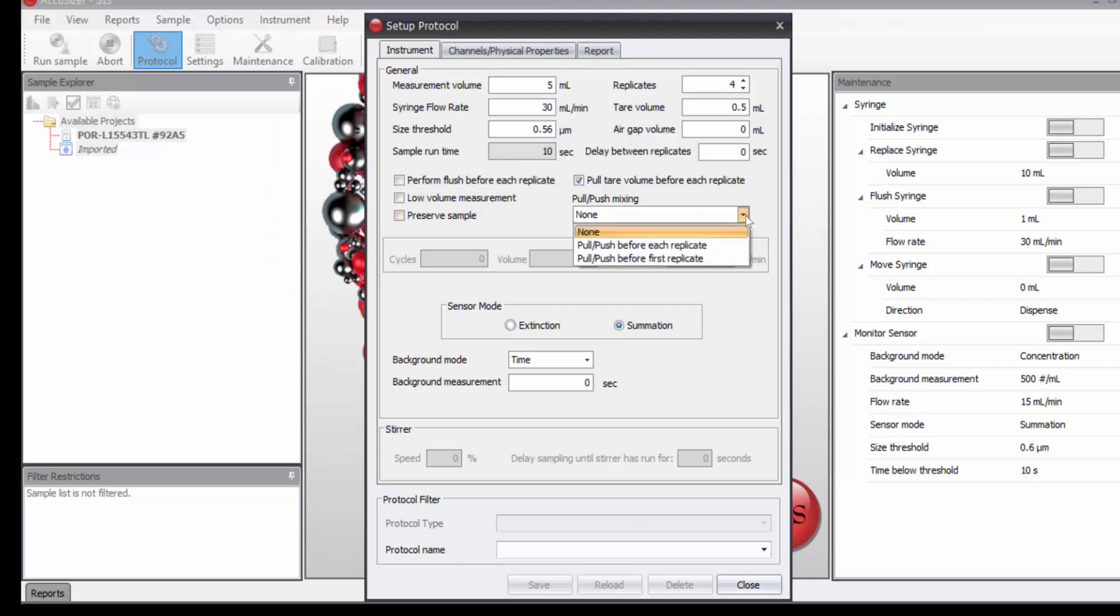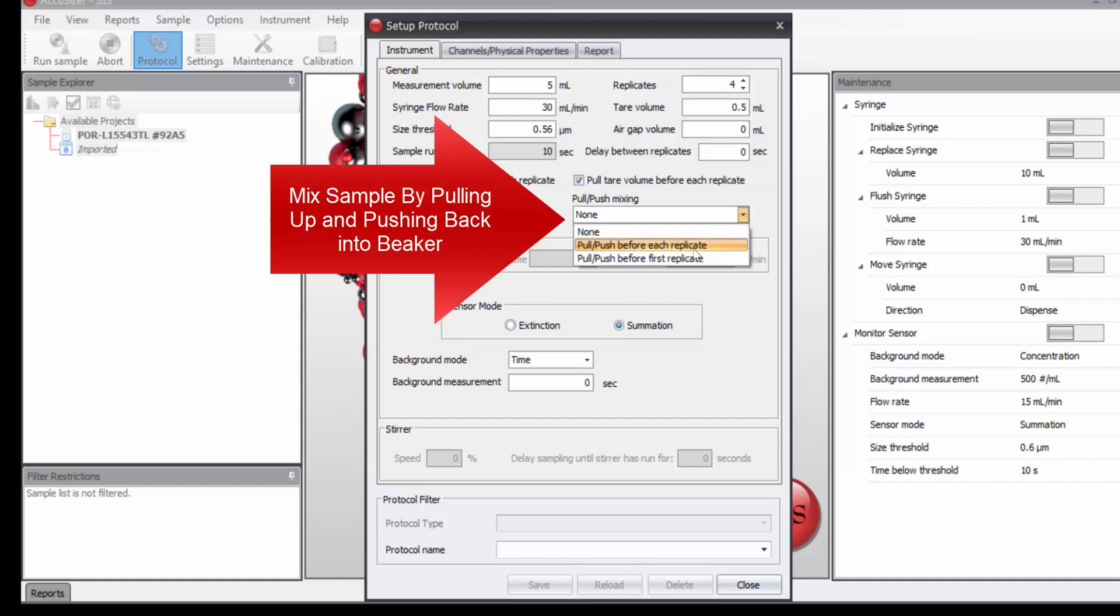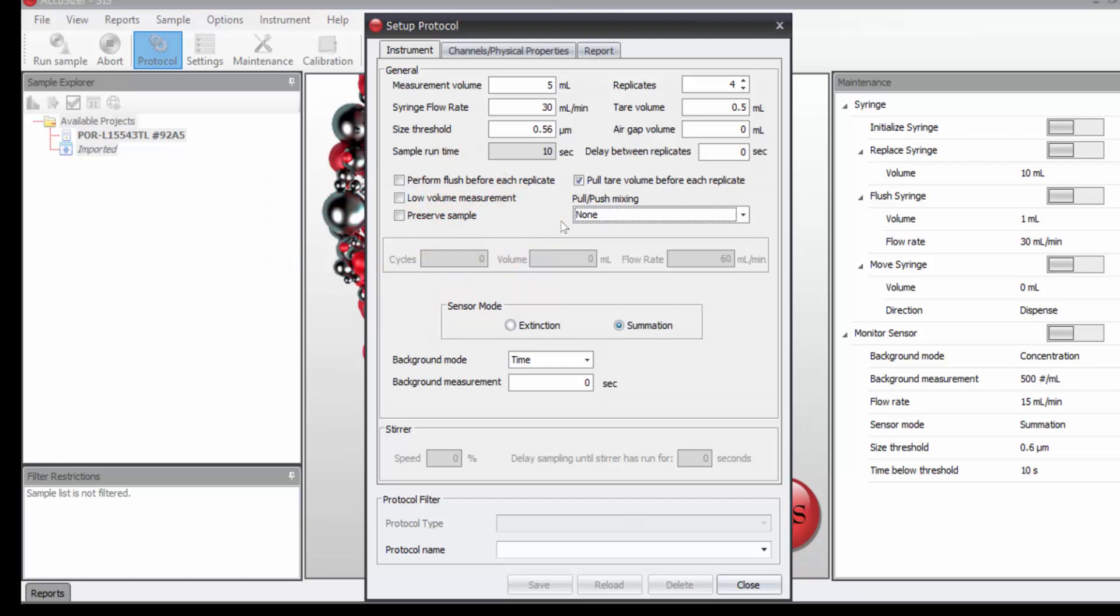We could choose to measure with a stir bar. But if we didn't have a stir bar or wanted to work at very small volumes, we could do what we call push-pull mixing. We pull the sample up and push it back into the same beaker before the measurement, but we will leave that at none.